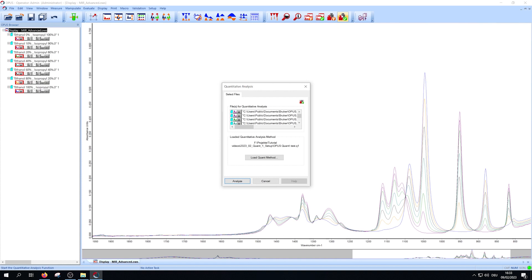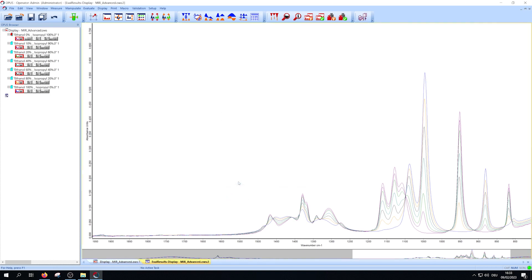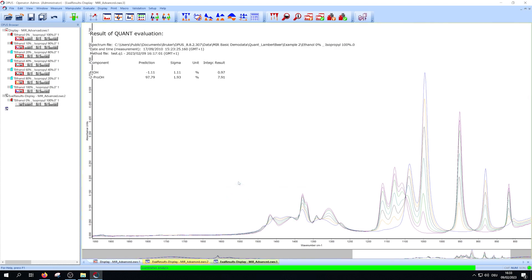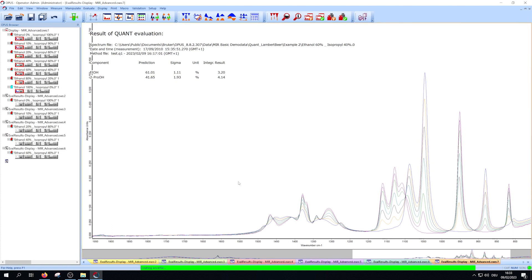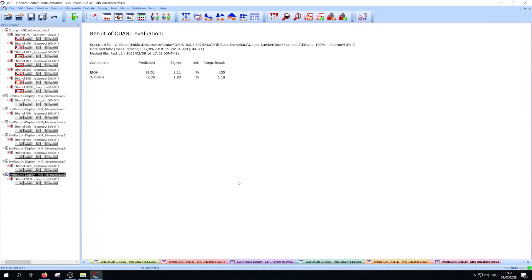If required select your method via the Load Quant Method button. To start press Analyze. Afterwards for every spectrum a result window will open. It shows the concentration of every component in your sample. You can print them if you want to.